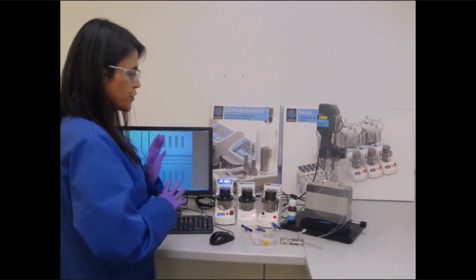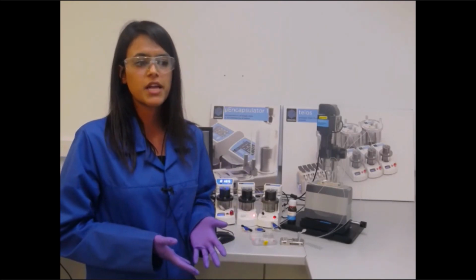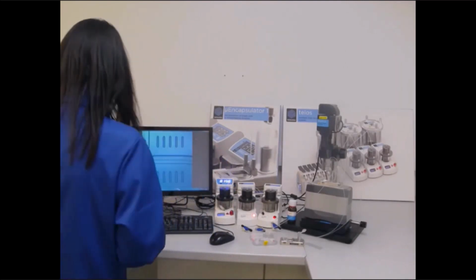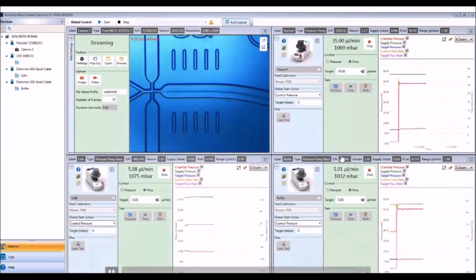In order for me to talk you through a little bit more about what our FCC, which is a flow control center software, looks like, I'll switch back to our presentation and talk you through how that works. Okay, so hopefully you can see my screen again. So this is what the FCC kind of looks like, as I've just shown you live.